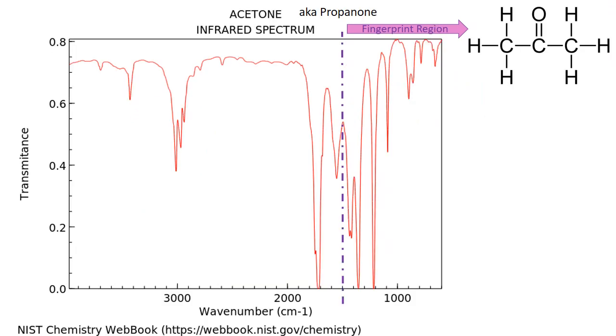So here we're looking at propanone, and we're looking at the display formula in the corner, and we can see that the most distinctive functional group is going to be that C=O. And we've already mentioned it's got a very narrow window inside the infrared spectrum, so it's a really useful distinguishing reading on the infrared spectrum, and we can see that there.